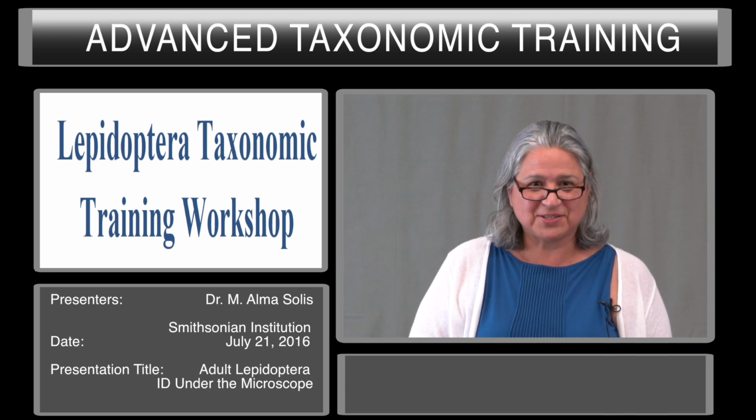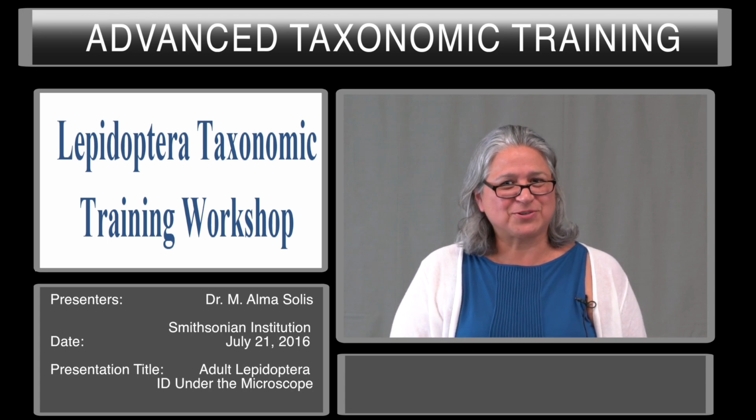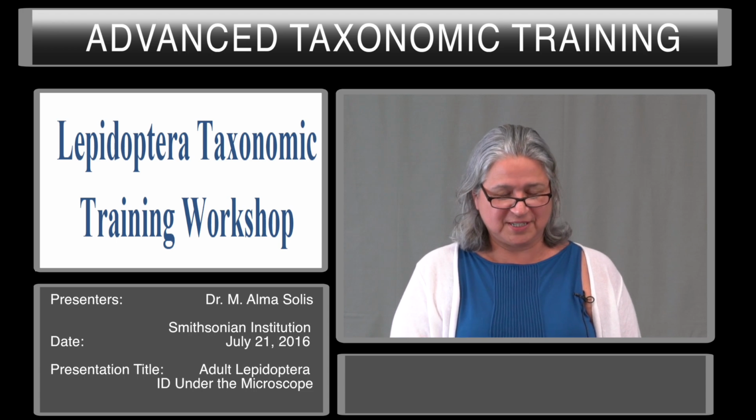My name is Dr. Alma Solis of the Systematic Entomology Laboratory. I work at the National Museum of Natural History, Smithsonian Institution in Washington, D.C.